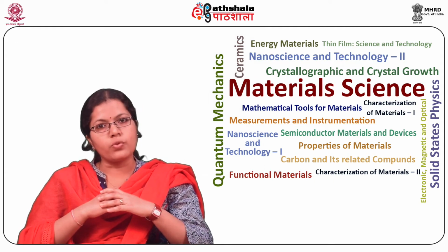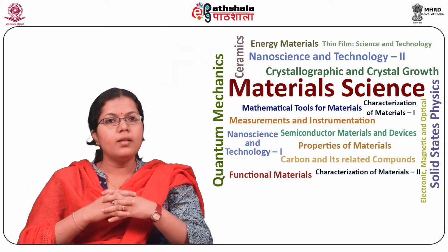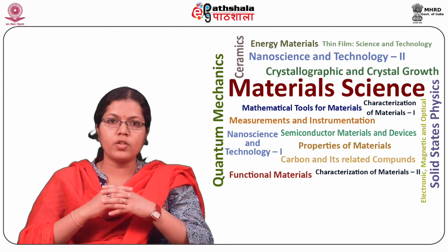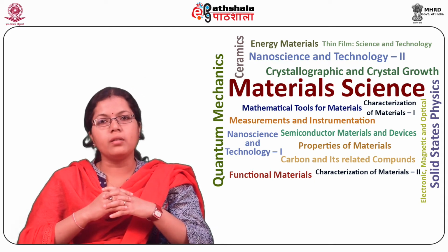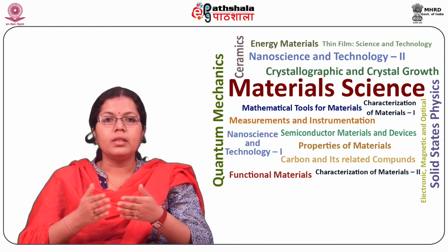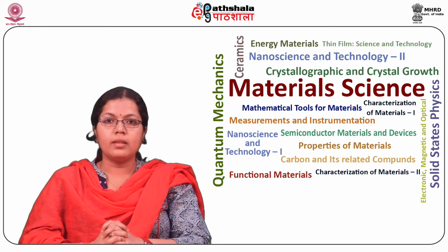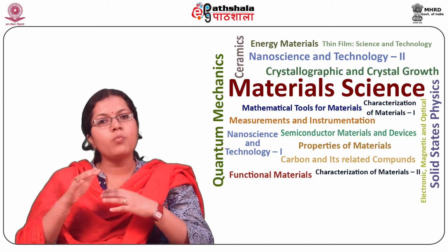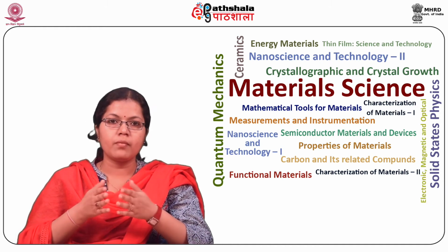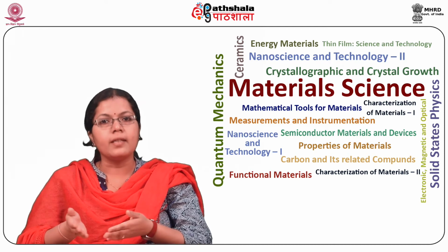The dual nature of electrons offers unique opportunities for the study of samples. The wave behavior is utilized in the formation of images and diffraction patterns. The charged particle behavior results in strong interaction with the atoms of the sample, giving rise to information on the chemical composition of the sample. Thus, it is possible to concentrate on a small region of the sample, typically from micrometer level to downwards, and obtain information on microstructure, crystallographic details, and chemical composition.